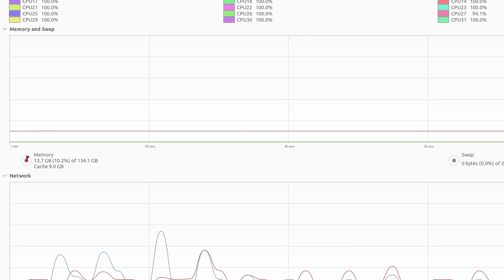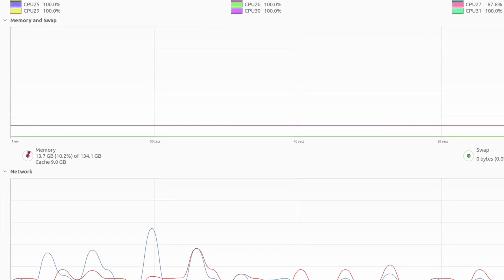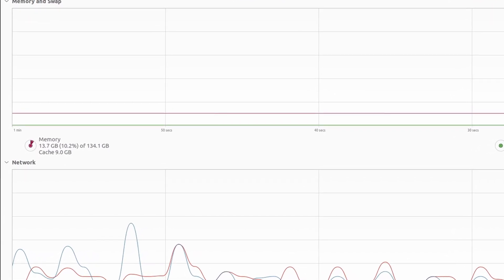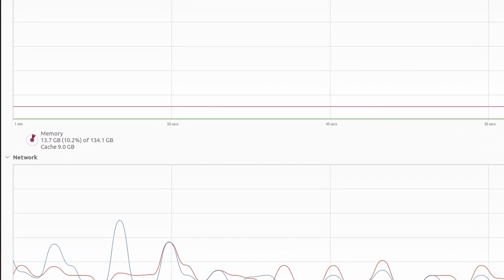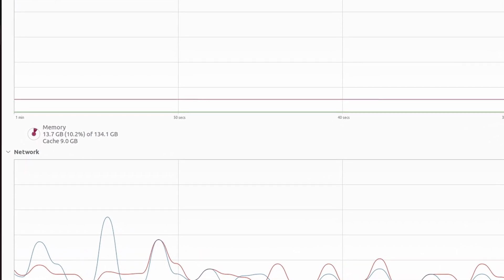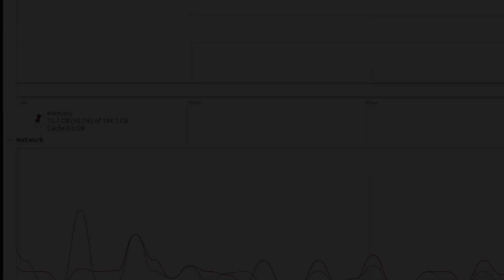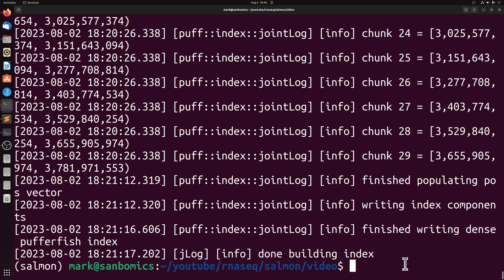And when I was running the salmon index, even with the decoy genome, I never used more than 13 gigabytes of memory. Once that's done, we can align our FASTQ files.